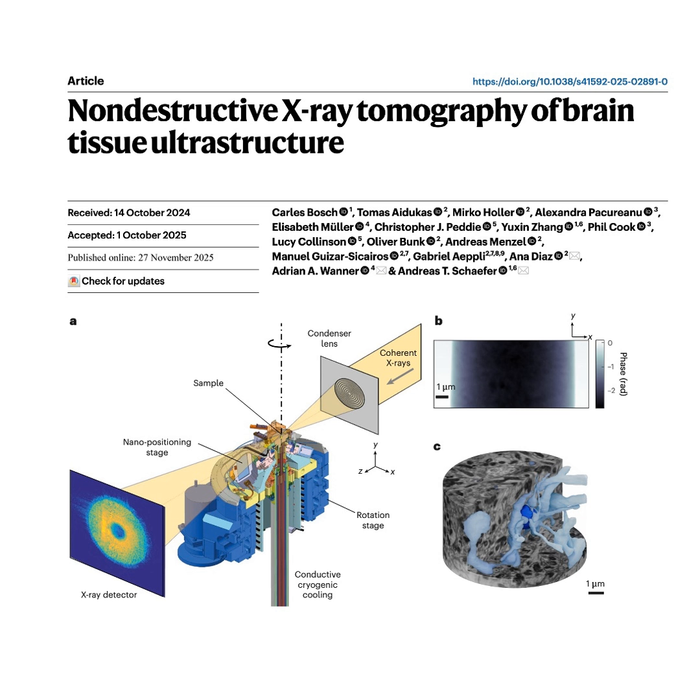16 times? Wow. And the researchers in the study cite an even crazier example. To increase resolution by a factor of 5, you have to increase the dose by a factor of 625. 625. So if your sample falls apart at a low dose, your high-resolution dreams are just over. Instantly, yes. Okay, so that explains why mapping a synapse has been locked behind the electron microscope. The challenge isn't the light source, it's the material.